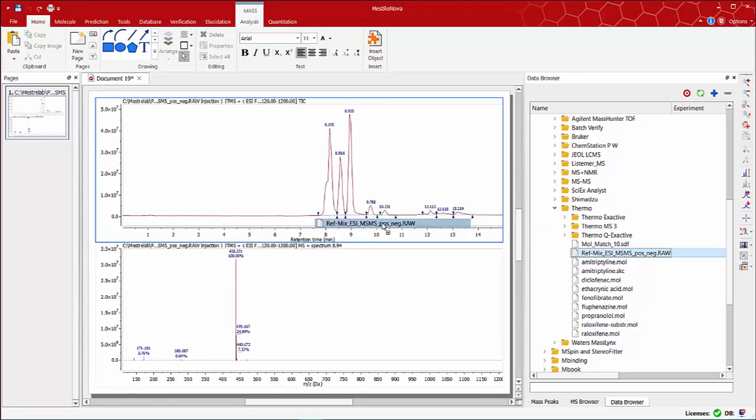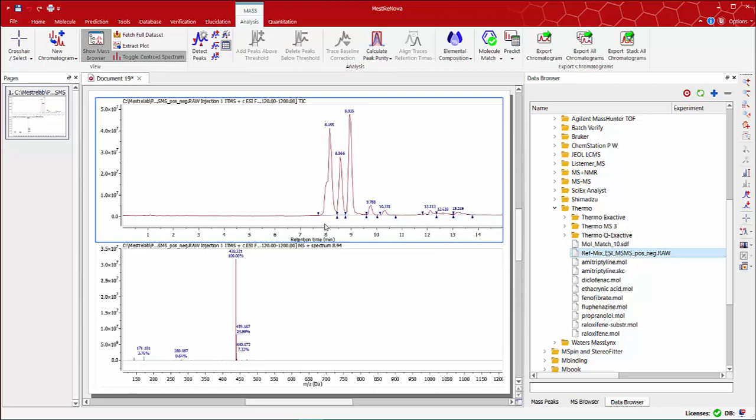By default the total ion current is displayed at the top and the mass spectrum plot from the highest peak at the bottom.